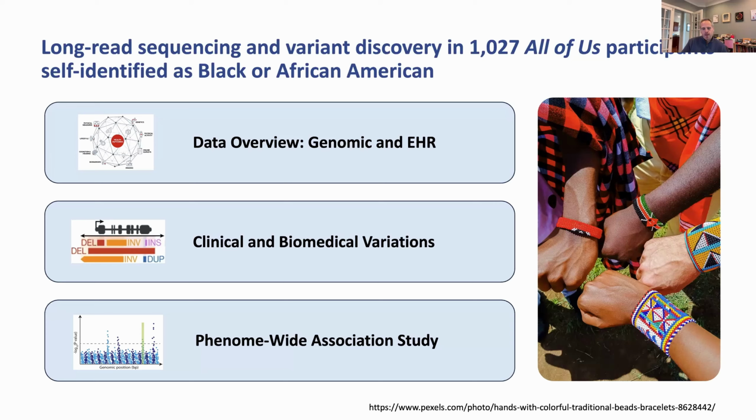association study, where because we have access now to their sequencing data, as well as to their medical records, we're looking over hundreds and hundreds of conditions and traits to be able to do an association, asking, what types of variation, if any, are associated with all these different traits that are present there. And I think I have some really exciting data to share with all of you that really indicates the importance of structural variation across many, many different traits here.